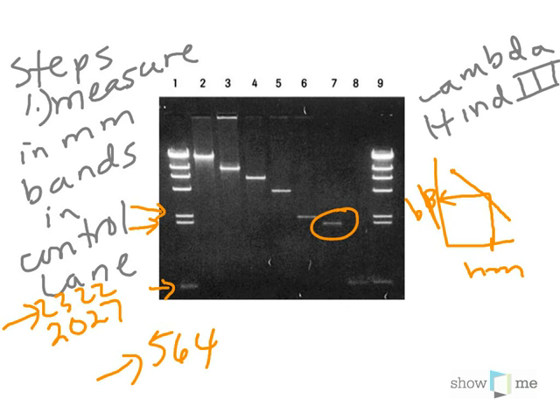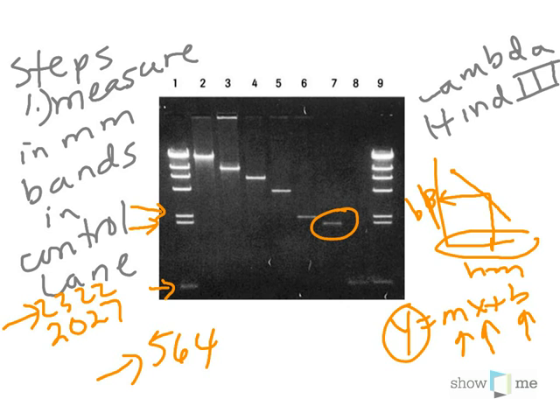Once you get the equation of the line, y equals mx plus b, if you know x, these numbers will already be filled in your graph, you can calculate y. That's really what all graphing software actually does.